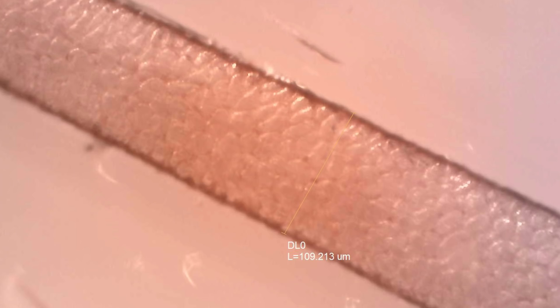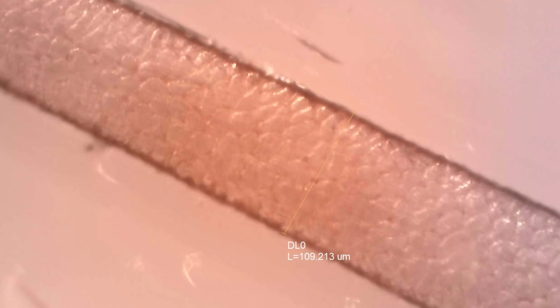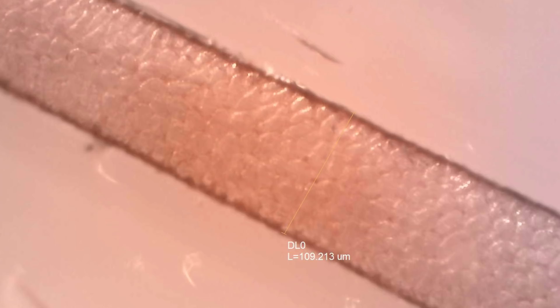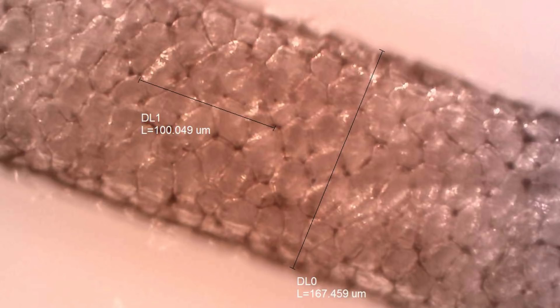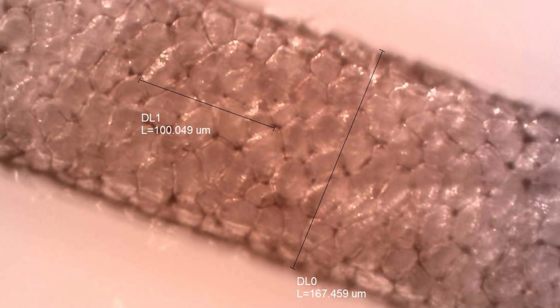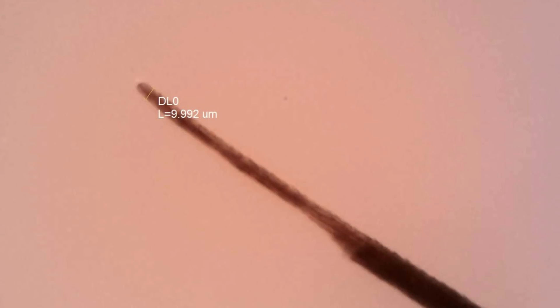Here's hair from white-tailed deer taken from the kill site. Deer hairs are readily distinguishable by their thickness and coarseness — they tend to be thicker than, say, coyote or rabbit hair, and tend to be the same thickness throughout most of the length. Under the microscope you can see an interesting pattern of circular cells filling the medulla, and the scale pattern looks fish-like — imbricate scales. White-tailed deer hairs tend to be 100 to 300 micrometers wide, with around three to seven scales per 100 micrometers.